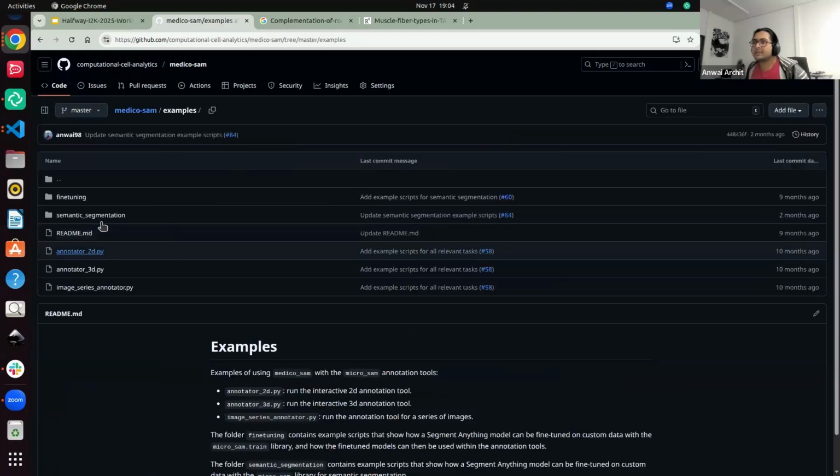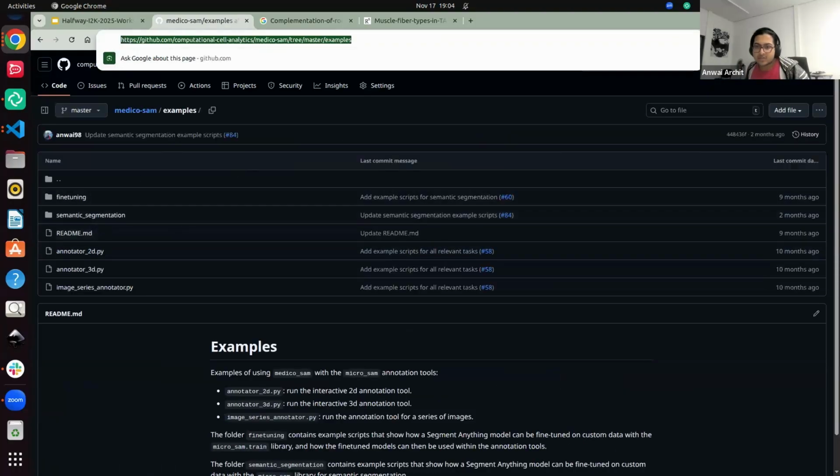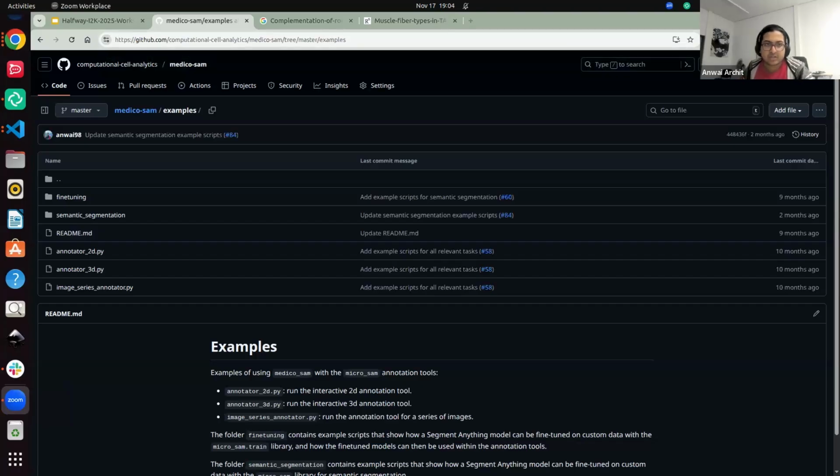Semantic segmentation right here. And this should be like a direct adaptation because our models are cross-compatible. So let's say if you're doing this for microscopy, you just have to use VIT-B LM, which is for microscopy, and this works out of the box. You do not have to install 10 different things or do 20 different things. Everything is just cross-compatible quite conveniently. Yeah, perfect.